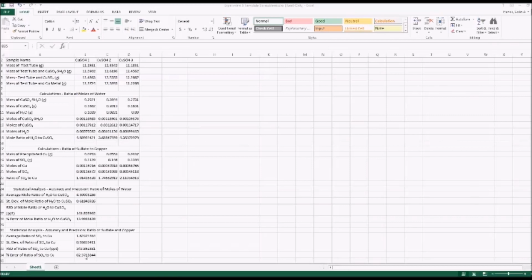This is most likely because one mass is based on another. So when we calculate the mass of sulfate, we calculate it by difference. If this tiny mass, 74 milligrams in this case of copper, is even a little bit off, it's going to also throw off the mass of sulfate. One way that we could do this experiment better is to start with a lot more copper sulfate pentahydrate at the beginning. Instead of starting with 0.3 grams, maybe we want to start with 10 or 20 grams of the compound. Then small differences in mass will cause less difference and, therefore, a smaller error.